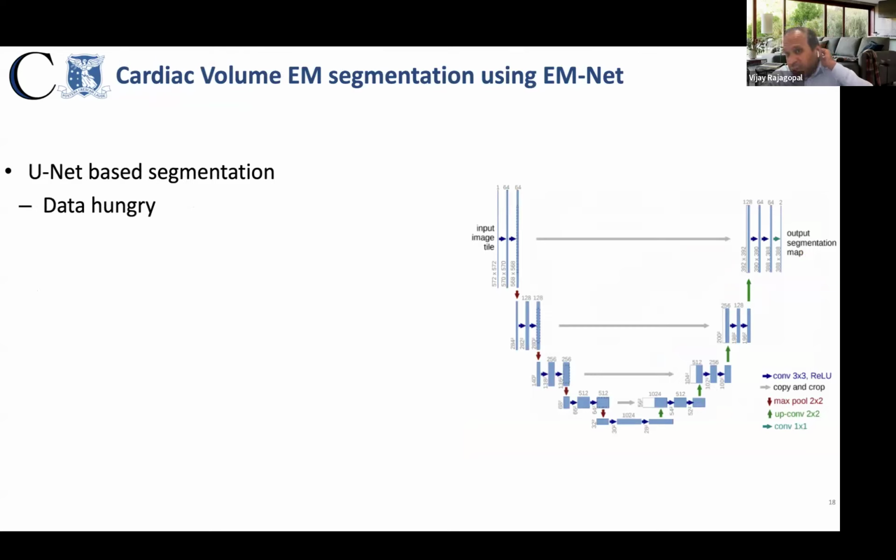And of course, ImageNet is a competition where people have been trying different AI models to see if they can segment all these structures of cells and images of cats and everything else using AI. What we wanted to do is see if we could segment our own data sets using UNets. We knew that it was data hungry. I don't know if it was at the same time that someone had already published, or I knew that they were going to publish, a UNet-based segmentation of electron microscopy data.